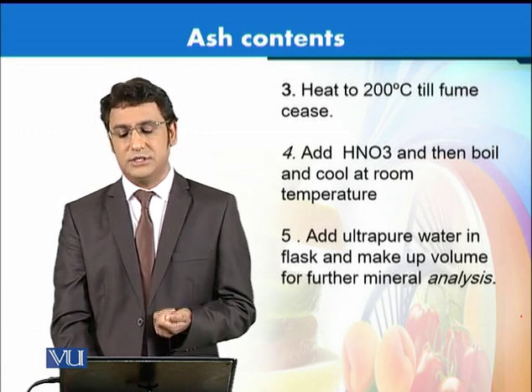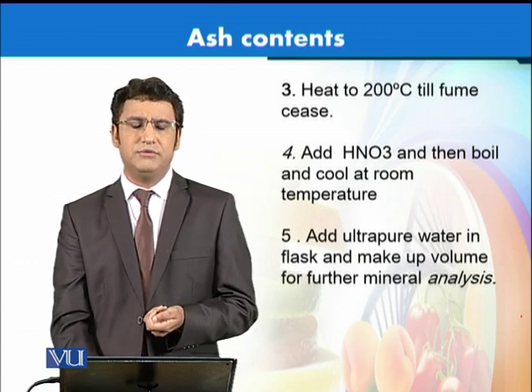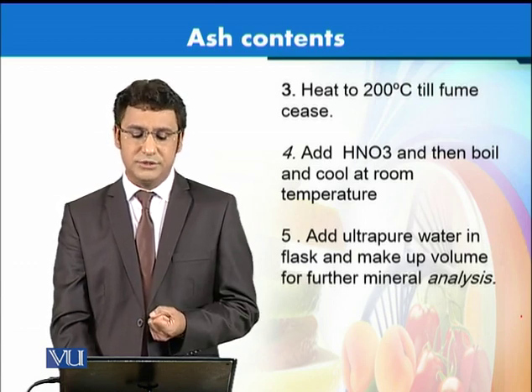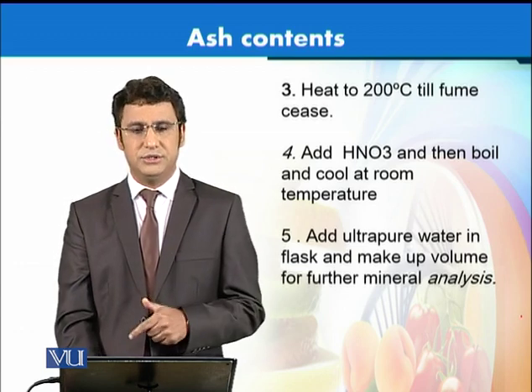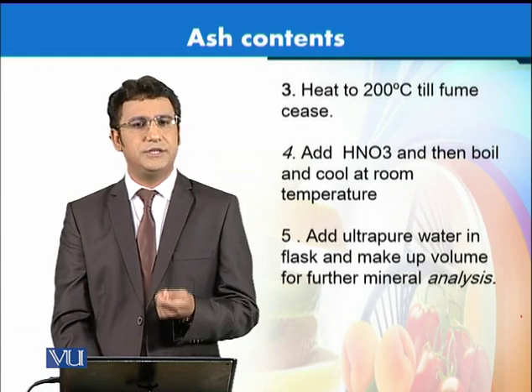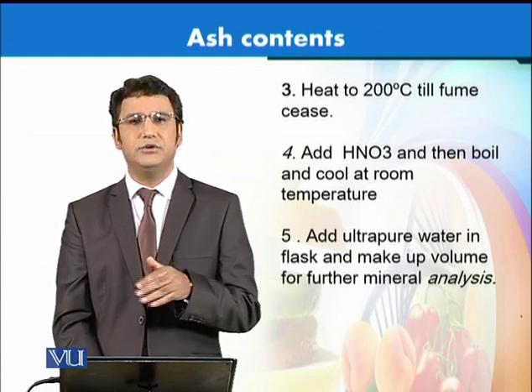Then we add nitric acid again and boil the sample. After boiling, we bring it down to a lower temperature, we cool it, then we add water, ultra pure water, into this flask. Why do we add ultra pure water? Because we don't want to add more minerals that are there in normal water.